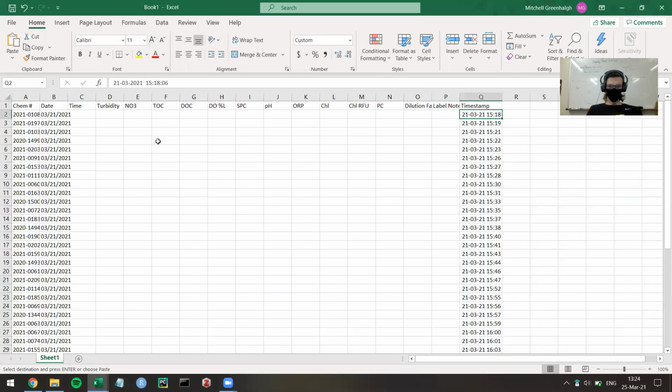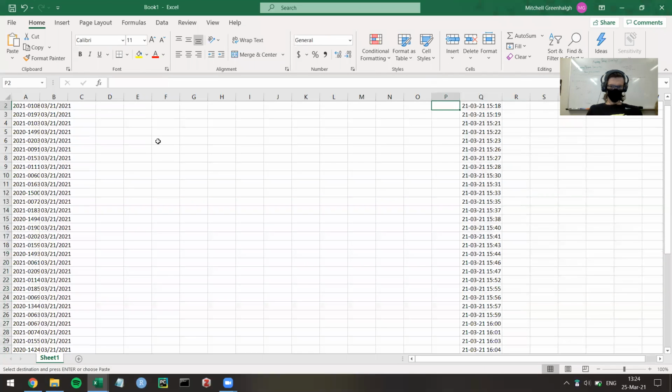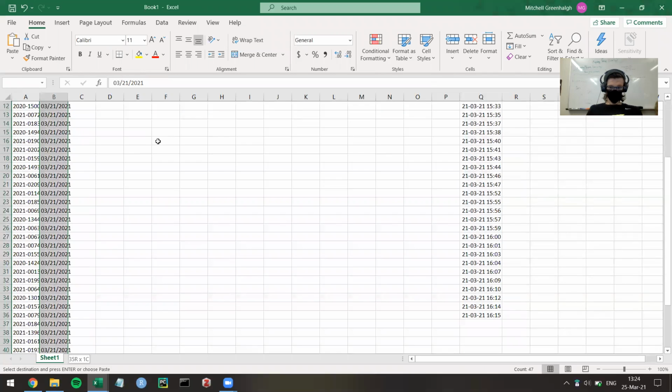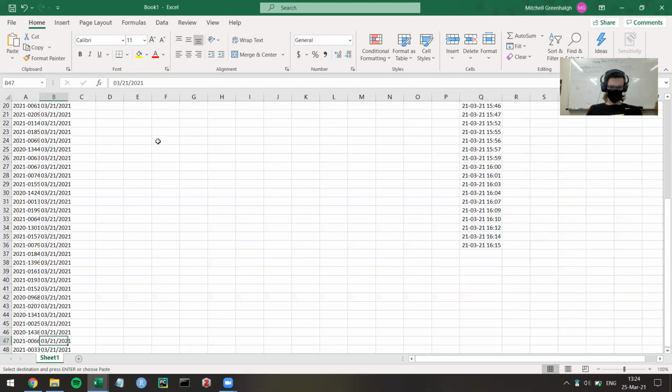If something doesn't line up, like there's only this amount of timestamps for this date, it does look like something is missing here, because these were all of the ones run on this date, but they only match up to this many samples, which doesn't seem correct.